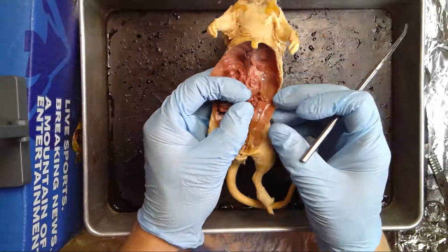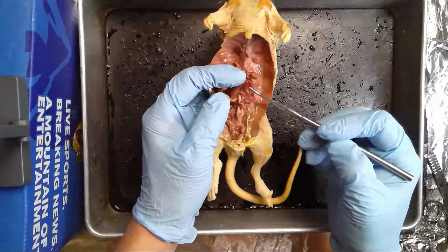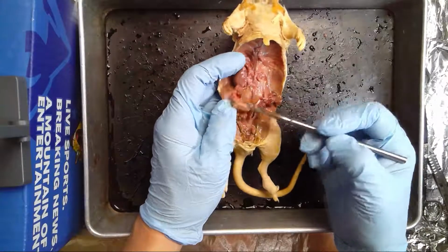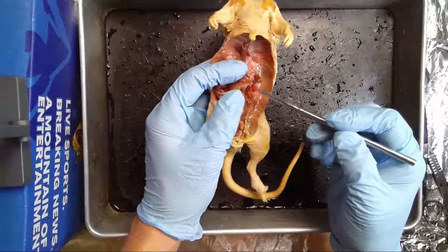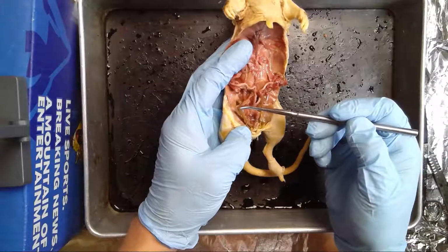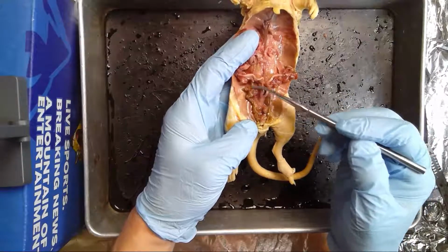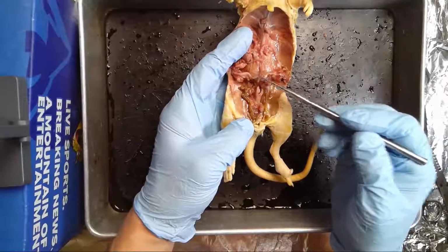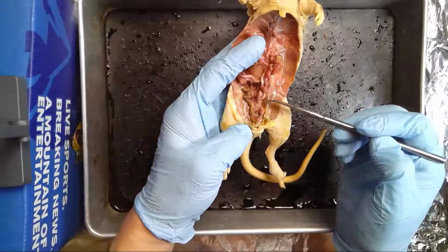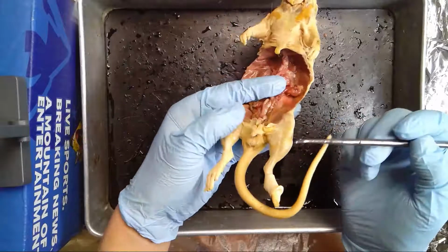That's the ovary. Now you'll see a lot of this red material here. That's fat. Okay, it just happens to have taken on a reddish color. That's probably a part of the fixation process. You'll see some more fat, which is yellowish in color, sort of a dark greenish yellow color. That's probably more typical of fat. But anyway, that is fat that's associated with the uterine horns. And of course, this goes to the uterine body, to the vagina, and then you have the vaginal opening here.